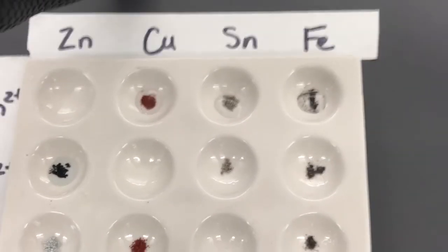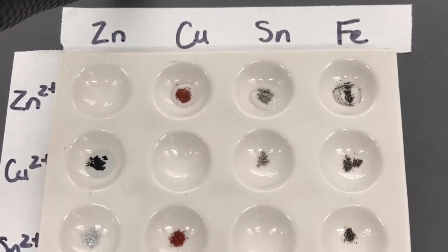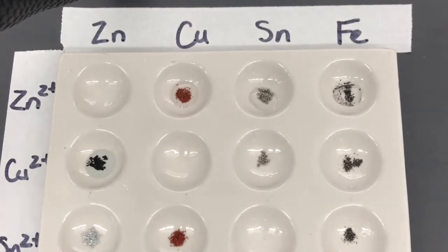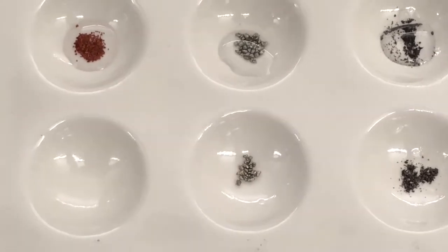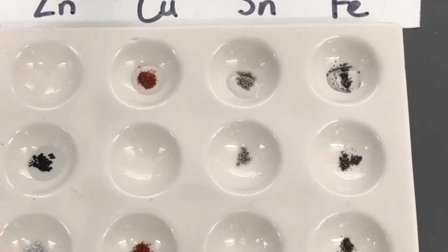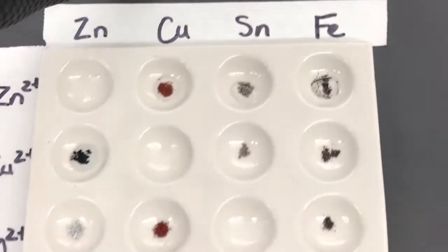So I'll zoom back out, and we can then look at what's happening when we add copper 2+ to the tin and copper 2+ when it's added to iron. You'll notice when we're looking at this, the tin metal is a little bit larger in size than the iron dust particles. It's just a difference of size. In some cases, the larger metals might take a little bit longer to react, so we'll come back to these plates at the end to see if we missed anything.